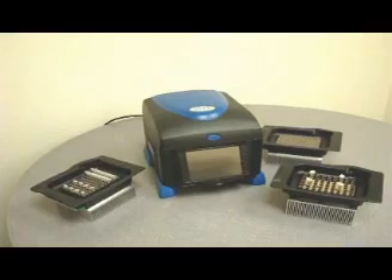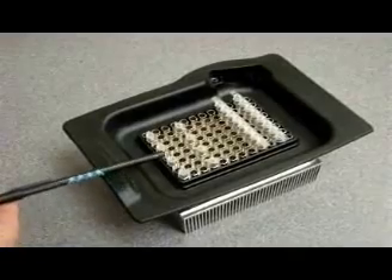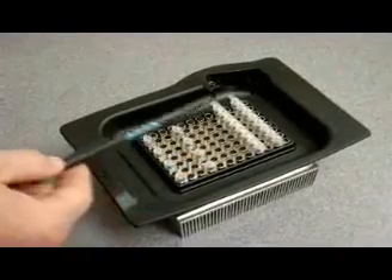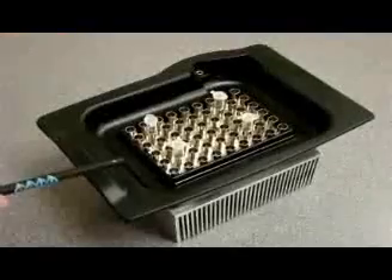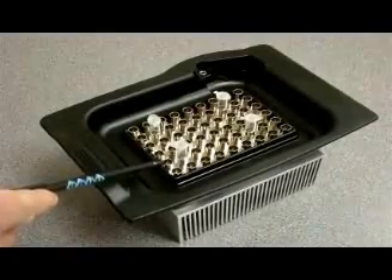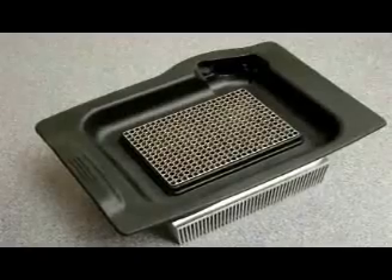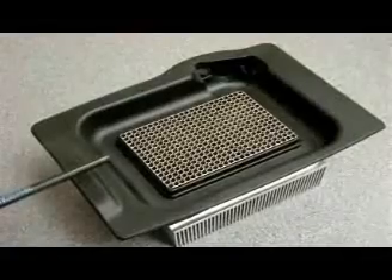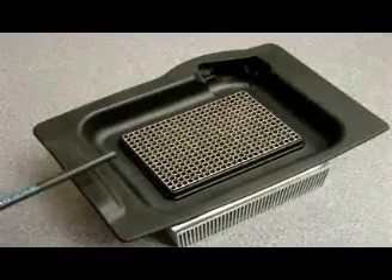The A6 will handle your research load for years to come. The 0.2 block is designed to handle individual 0.2 tubes, flat cap or dome, and 8-strip 0.2 ml tubes, with the additional 96-well 0.2 plate. We also have a block built specifically for 0.5 tubes — this block will handle 54 0.5 PCR tubes. For those who need high throughput, we offer a 384-well configuration, and there is also a block available for slides.